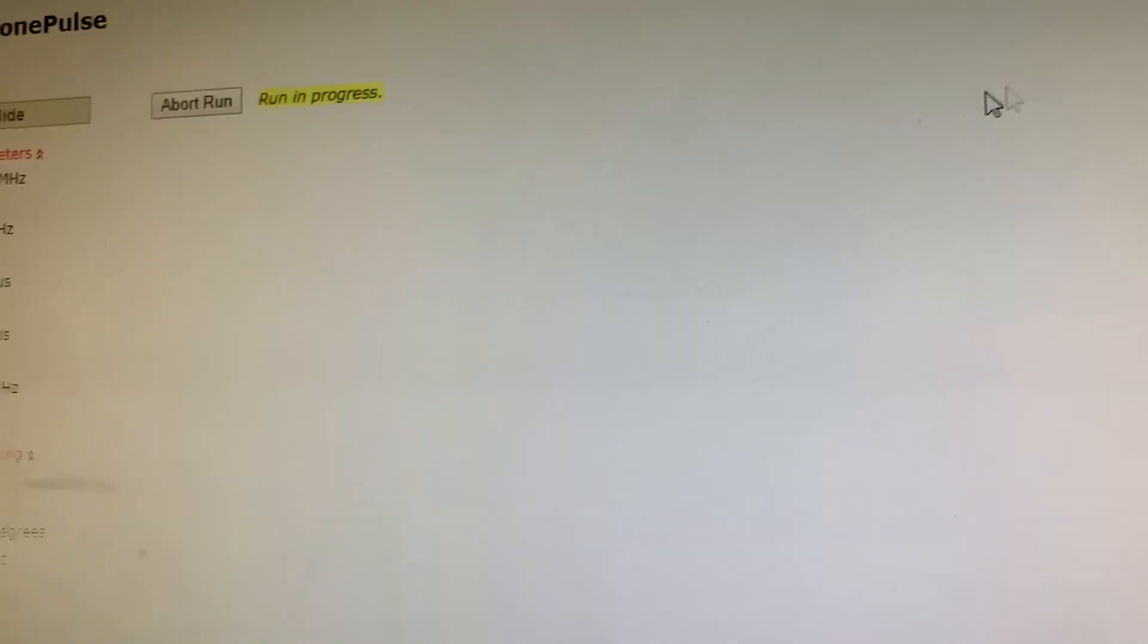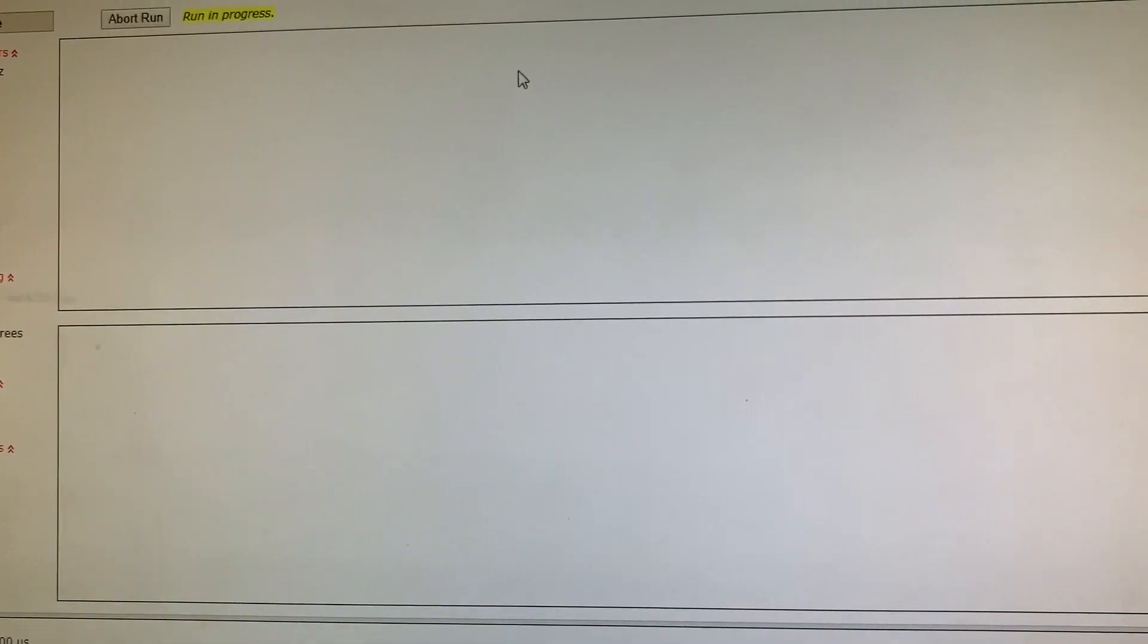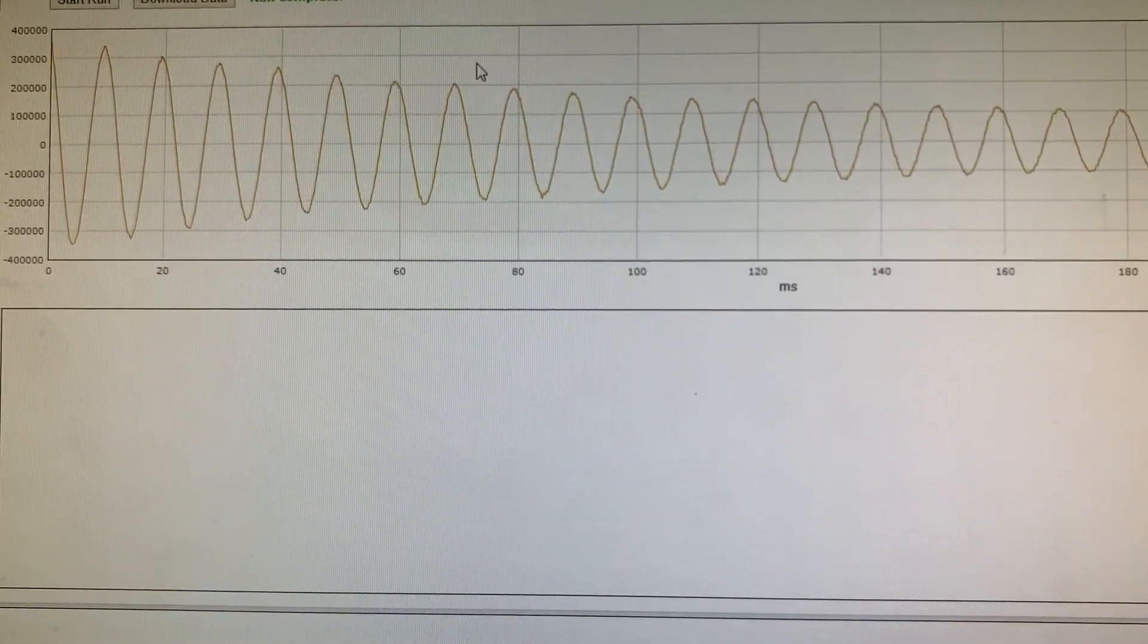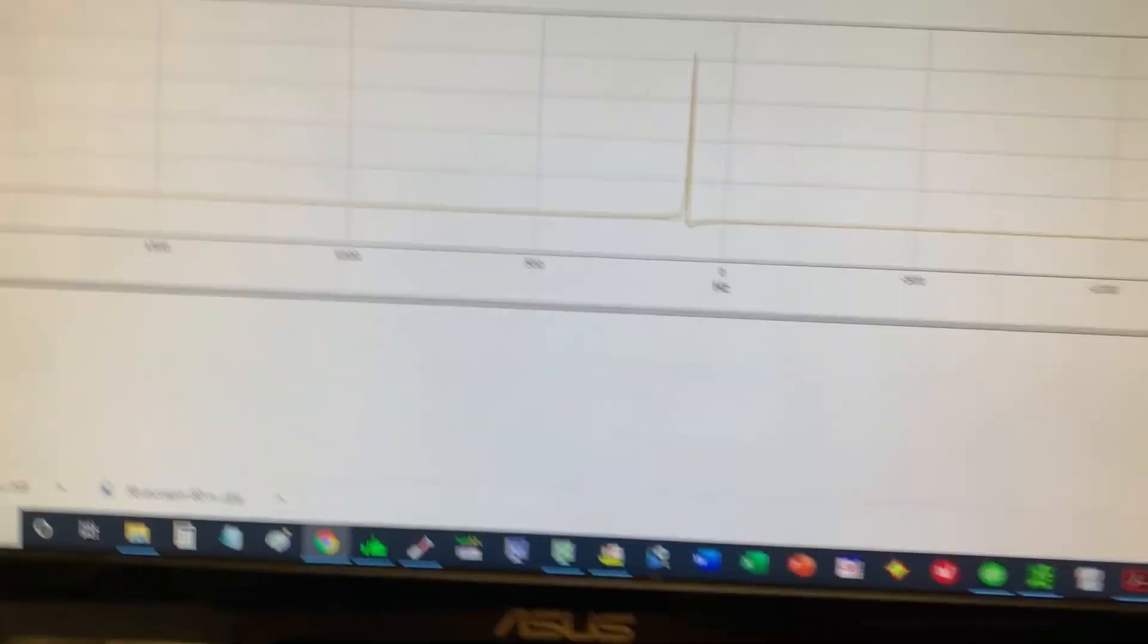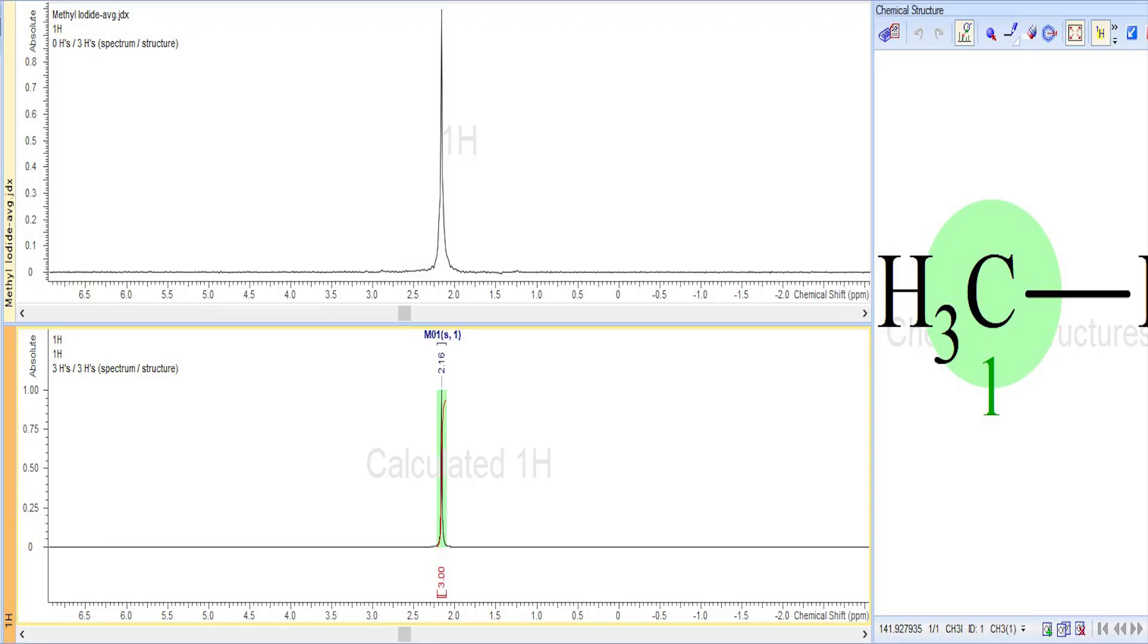The thing that is nice about the system is I can use the sample as is. It's not required that I have a deuterated solvent, so I can just get a nice spectrum and use that to check my material. When I do, I get what I think is a great-looking spectrum. Mine is the one on top compared to a computer-generated version of iodomethane at 82 megahertz on the bottom. I do plan on explaining the FTIR and the NMR better in the future.